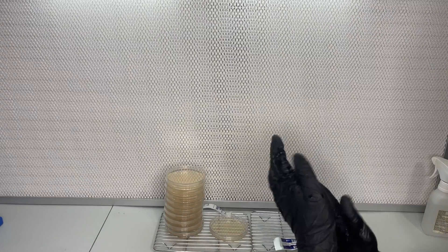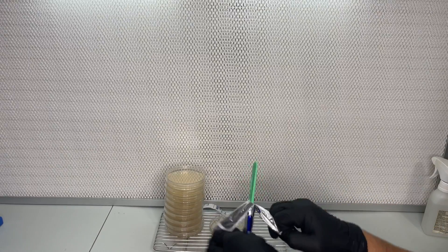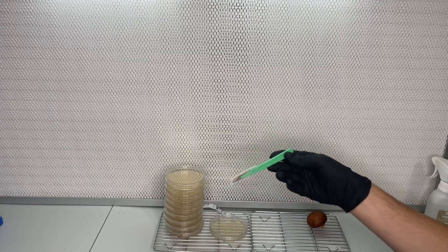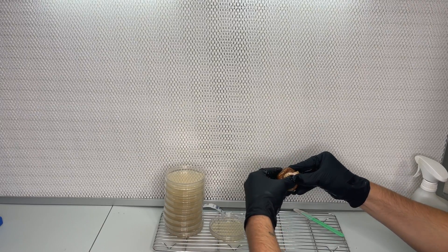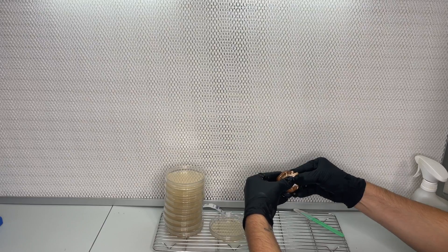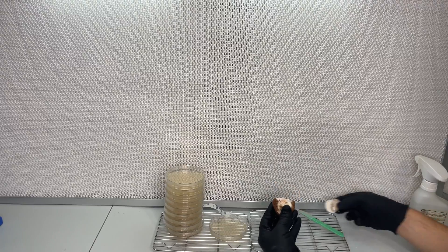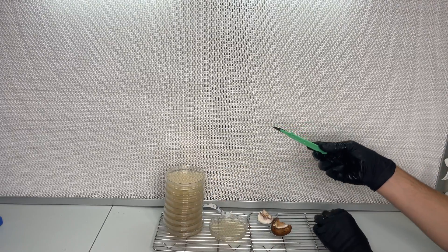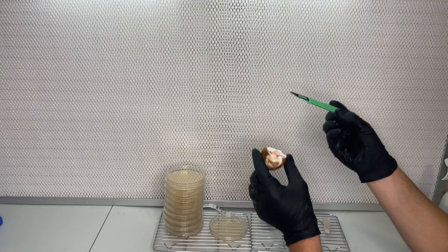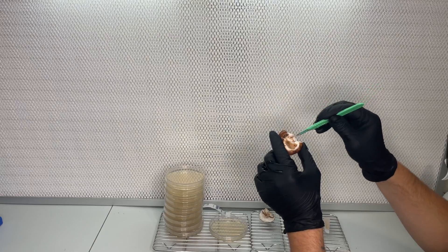The first step is to start with a fresh button mushroom which you can find at any grocery store. In a clean environment, preferably inside of a still air box or in front of a laminar flow hood, I rip the mushroom in half exposing the sterile tissue on the inside. Then I use a sterilized scalpel to transfer a piece of that tissue to some pre-made sterilized nutrient agar plates.